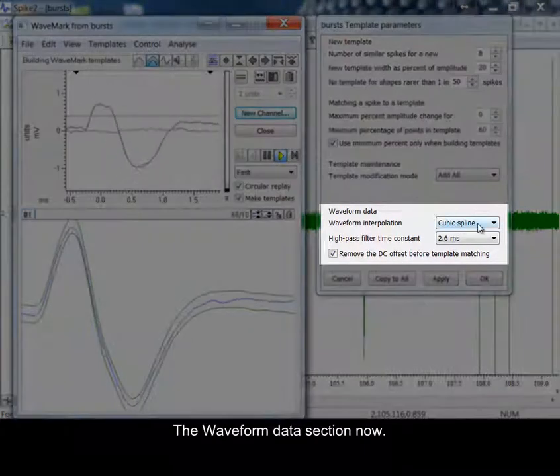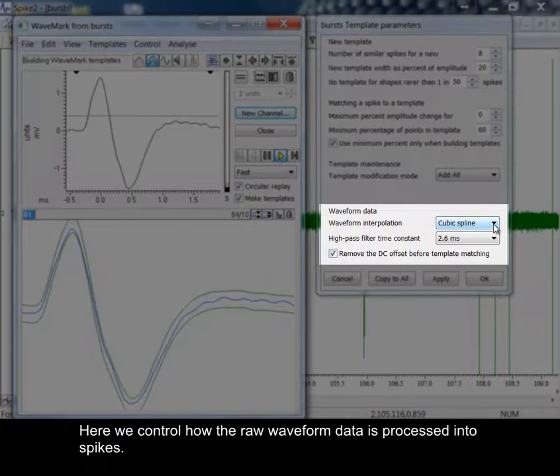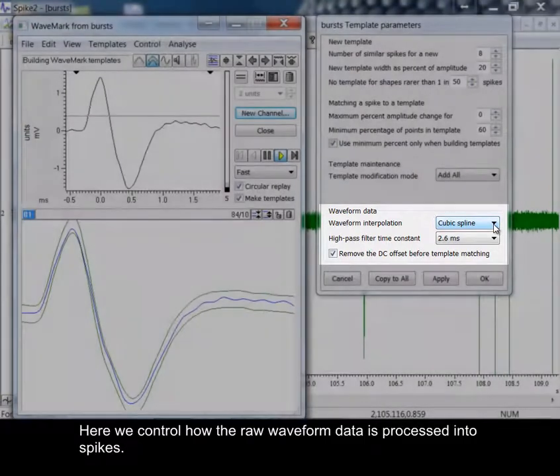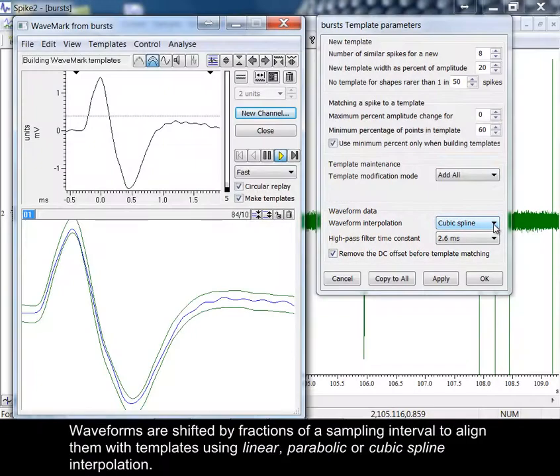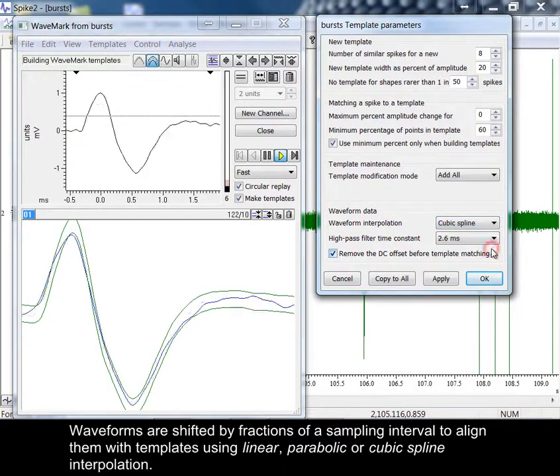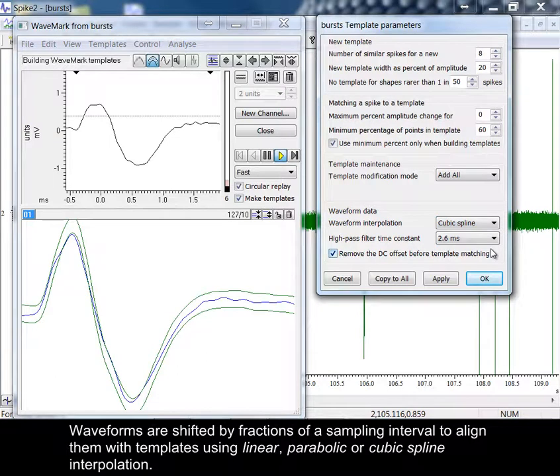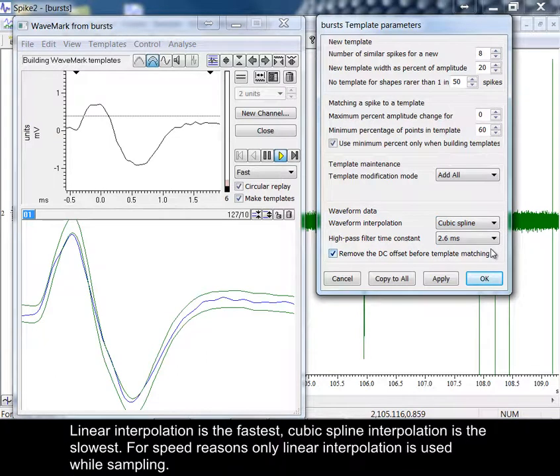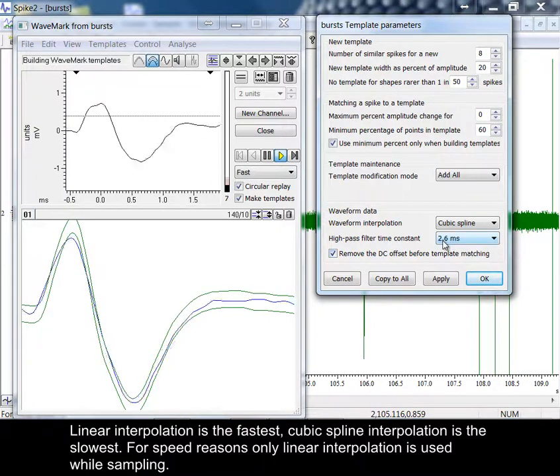The waveform data section now. Here we control how the raw waveform data is processed into spikes. Waveforms are shifted by fractions of a sampling interval to align them with templates using linear, parabolic, or cubic spline interpolation. Linear interpolation is the fastest. Cubic spline interpolation is the slowest. For speed reasons, only linear interpolation is used while sampling.